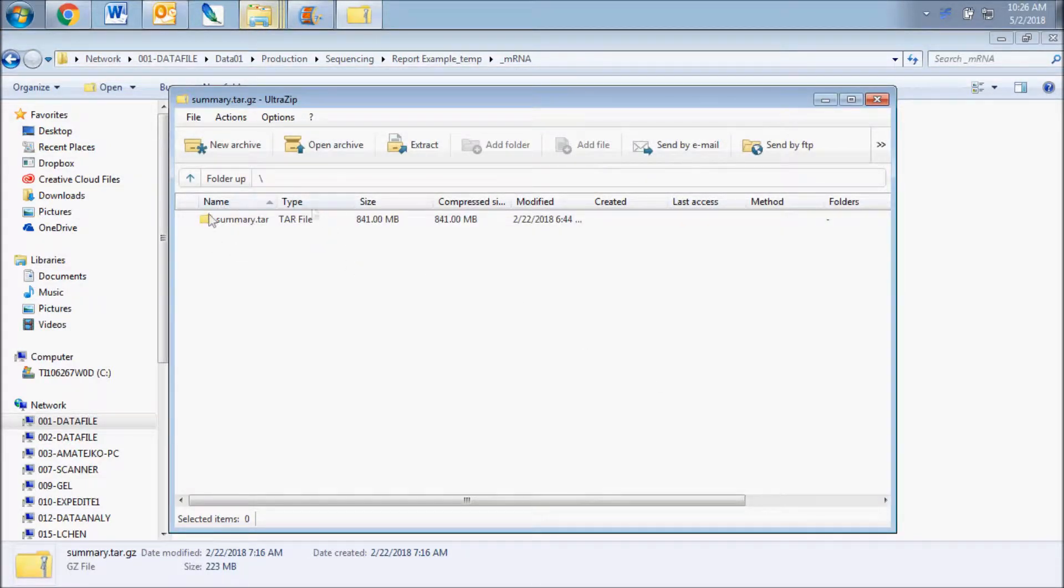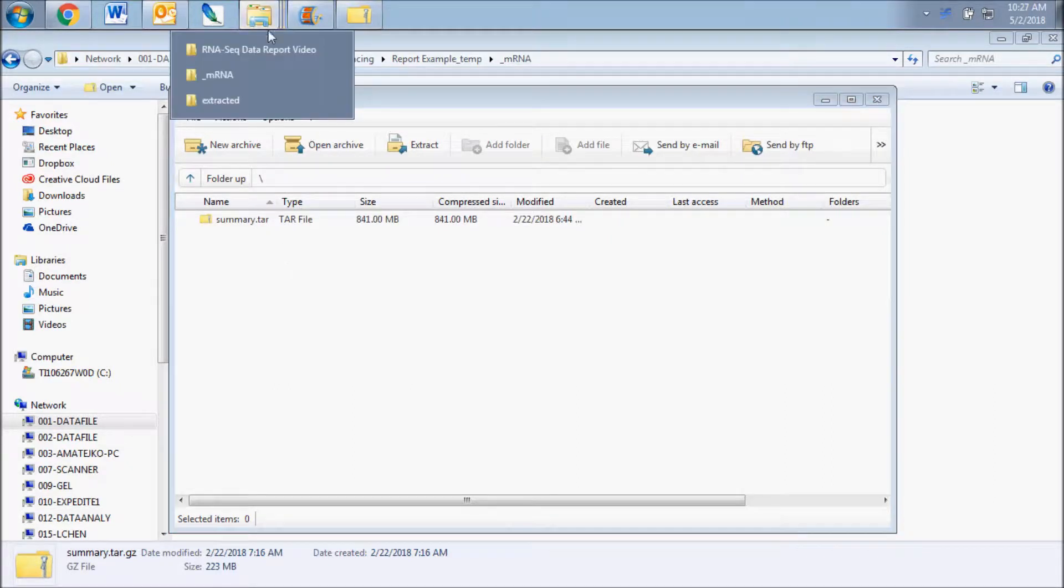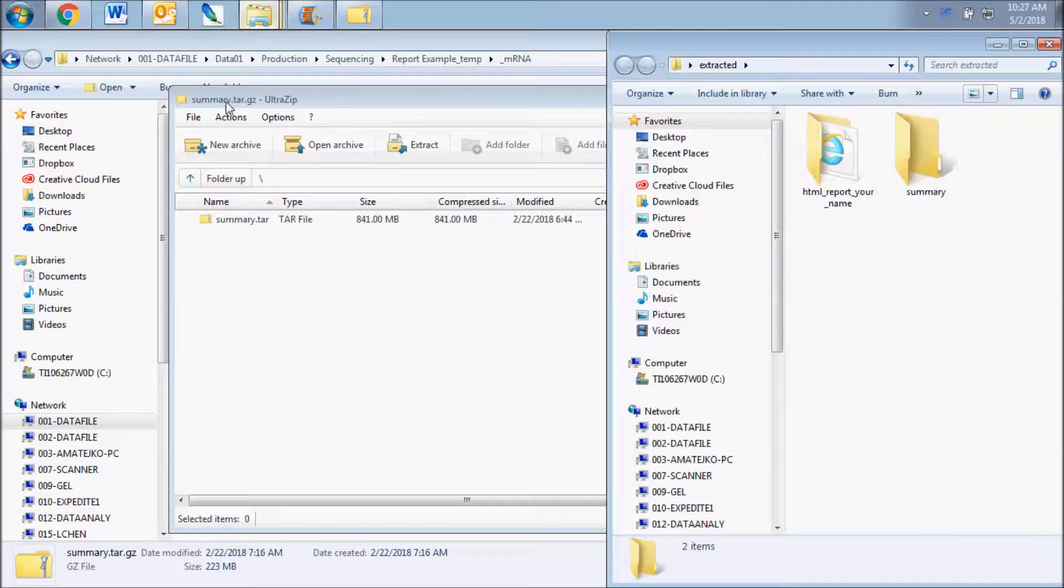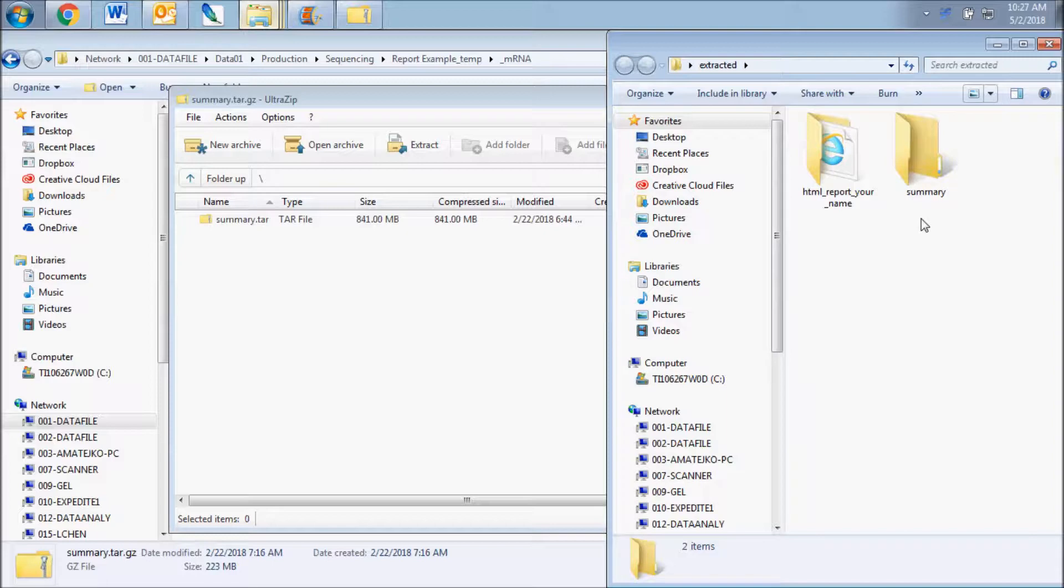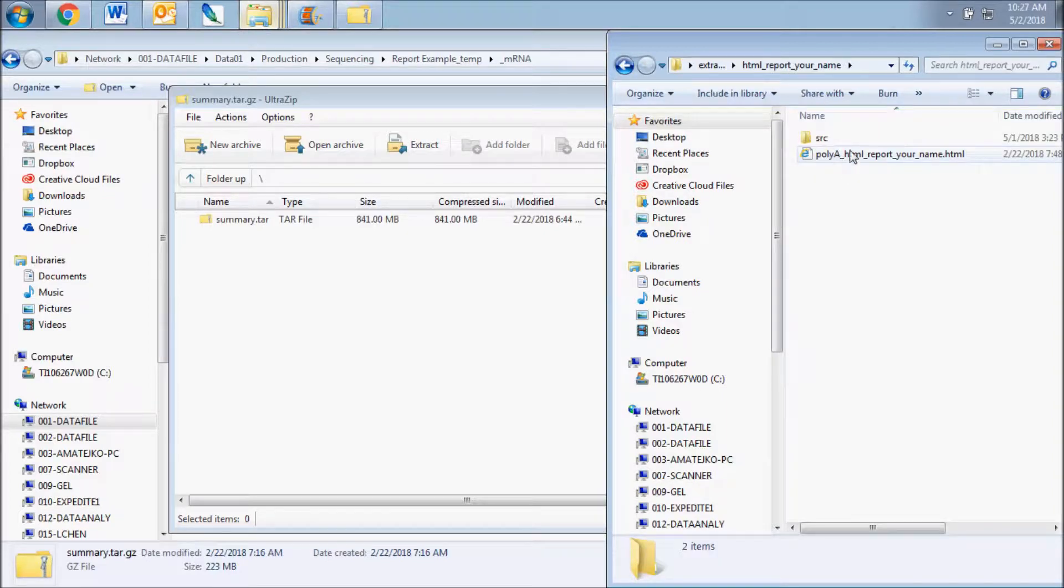You will see one folder titled Report and the other titled Summary. In the HTML report folder, you will find an HTML file and a folder titled SRC.